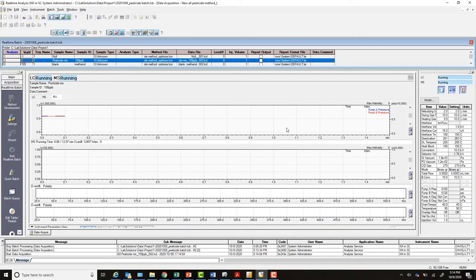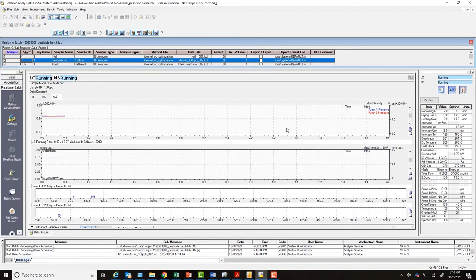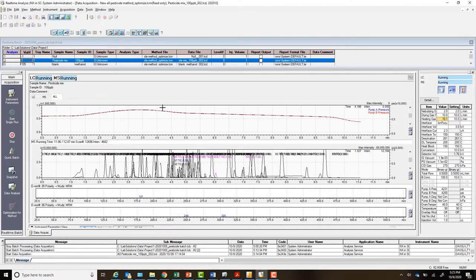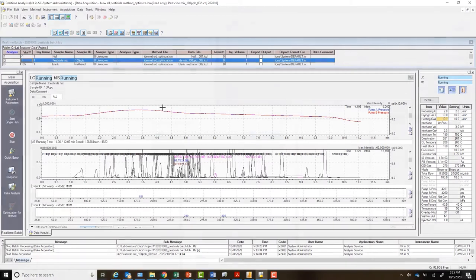After acquiring high sensitivity, high mass accuracy MS and MSMS data, an automated data processing workflow can be applied.